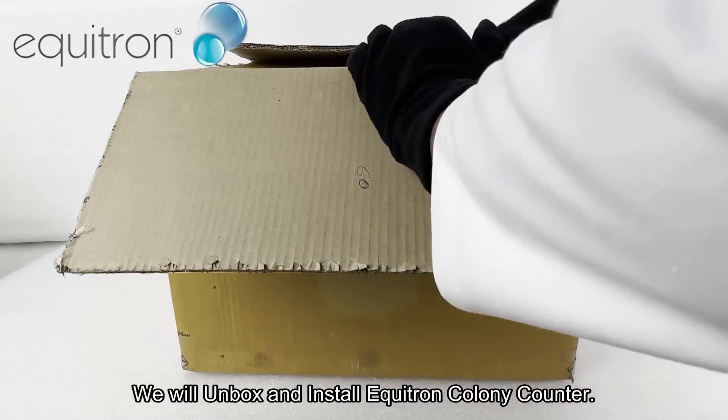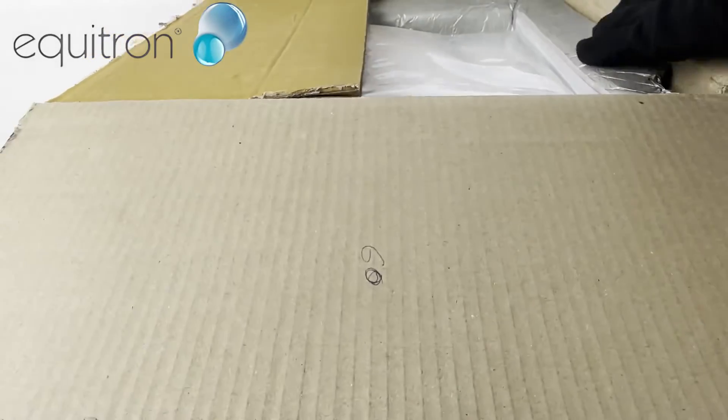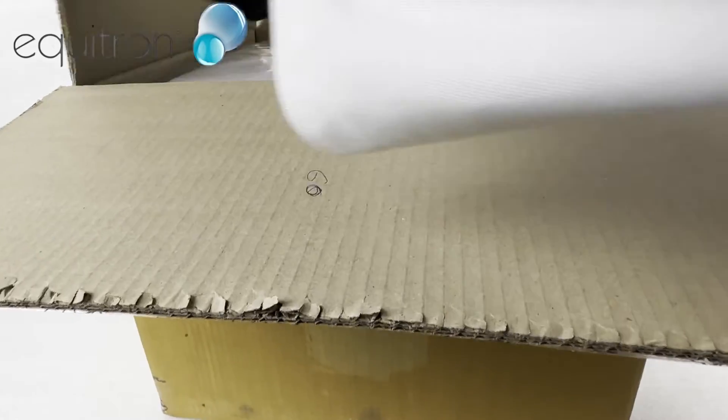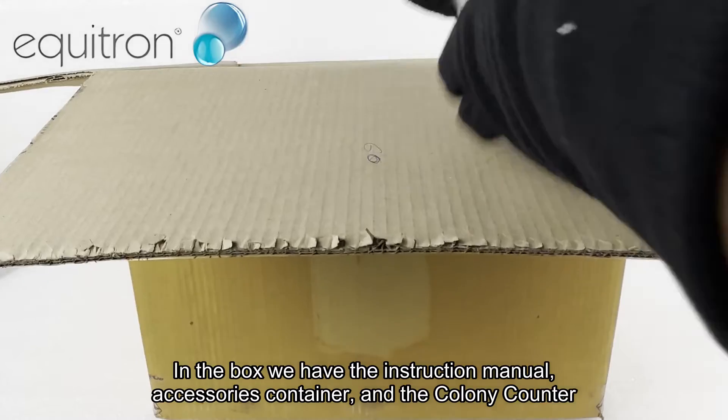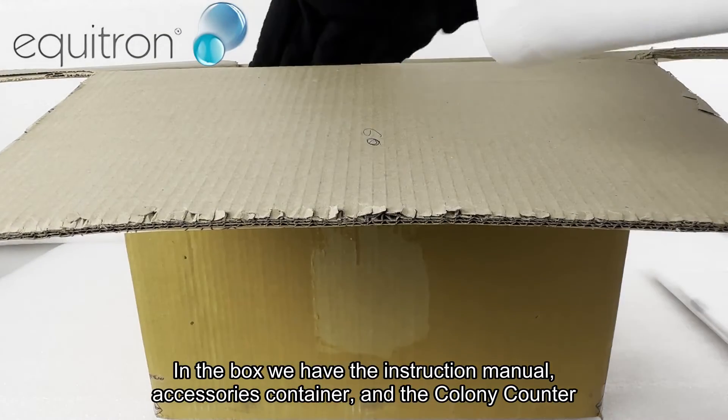We will unbox and install the Equitron Colony Counter. In the box we have the instruction manual, accessories container, and the colony counter.